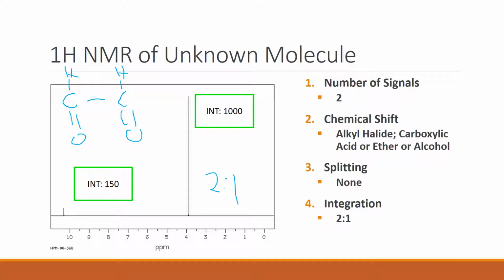They both touch a carbon. To the next side of them, there's a carbon double bonded to an oxygen. These guys' peaks would show up on the same spot in the H. It might not be there, but they would both be in the same exact spot.